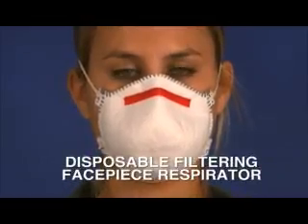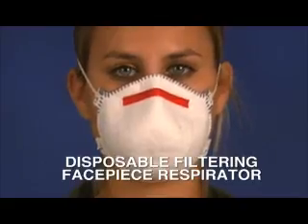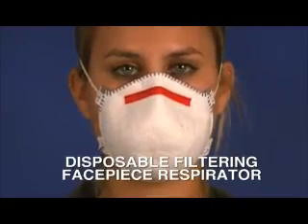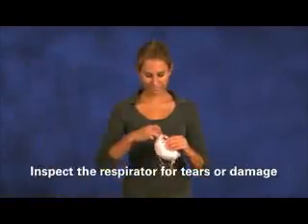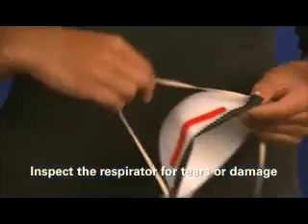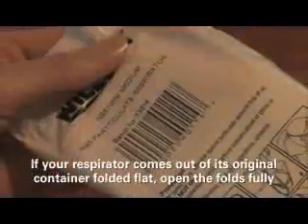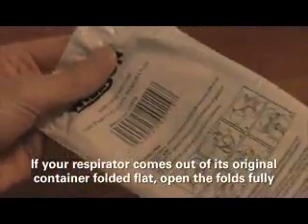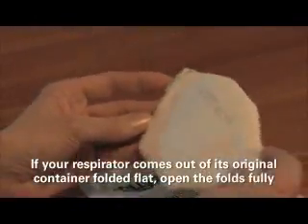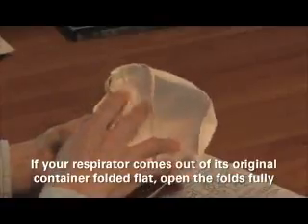Let's begin with general instructions for a disposable filtering facepiece respirator, which is often referred to as an N95 or a dust mask. Inspect the respirator, including the straps, for tears or damage. If you find any damage to the respirator, replace it. If your respirator comes out of its original container folded flat, open the folds fully, following the manufacturer's instructions.